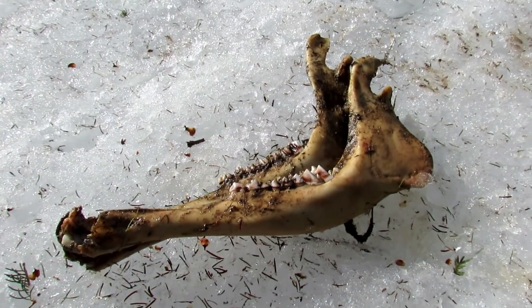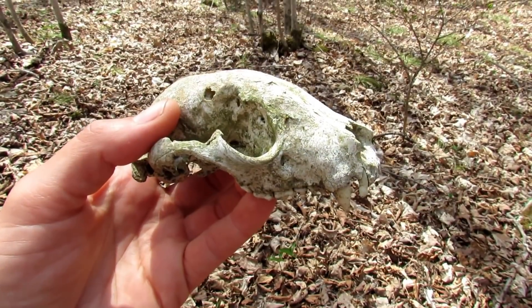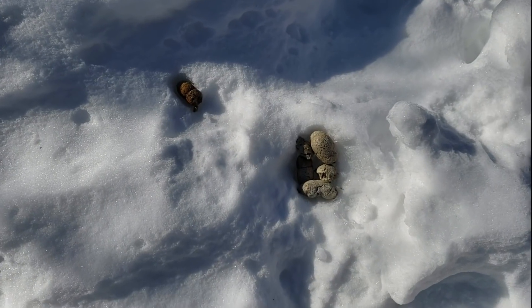Wildlife forensics covers cases involving the death of an animal that may have had an illegal demise. These techniques can also be used in research to determine what species has been present in an area or what an animal has been eating. Samples can be analyzed from hair, bone, teeth, stomach contents, and even feces.